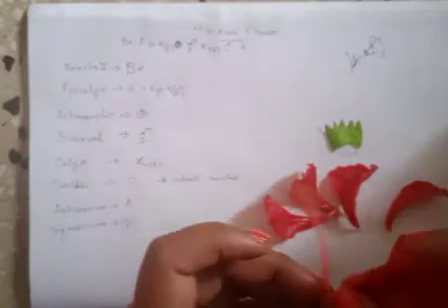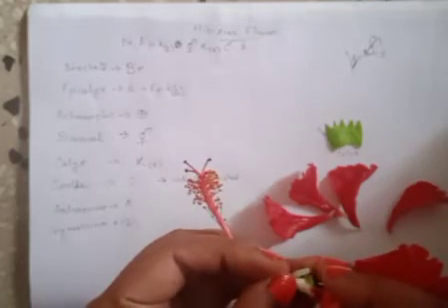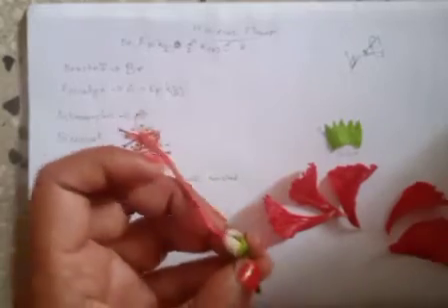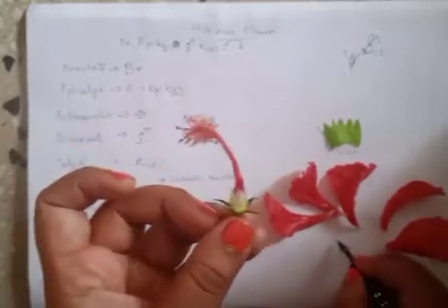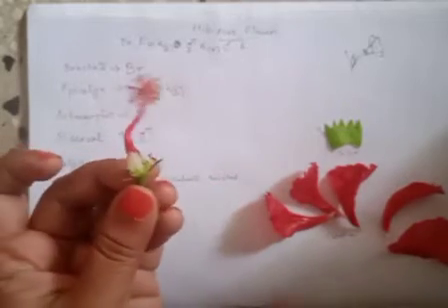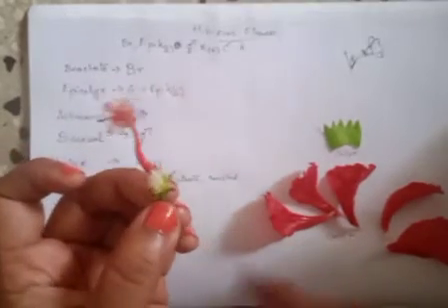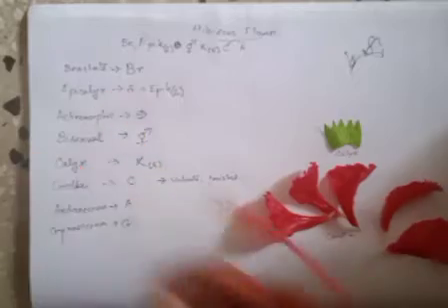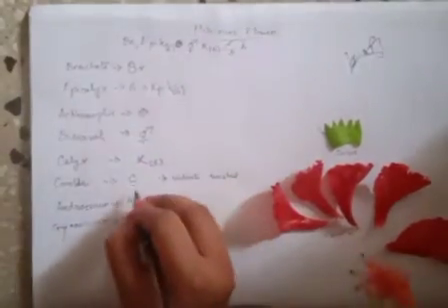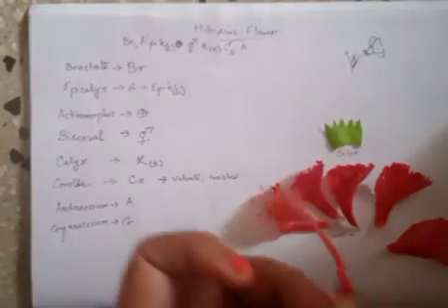In this flower. Fine. So this is my corolla that I have. Okay, so here I have got the petals. There are 5 petals, so I can write C5. As it is free, I will just put C5.